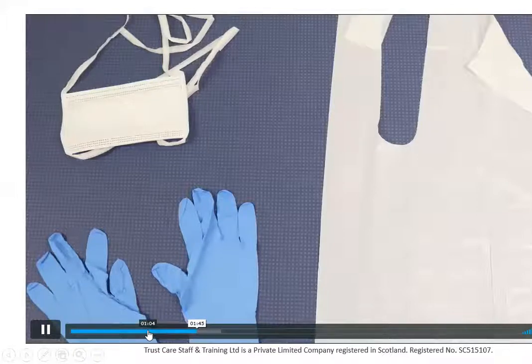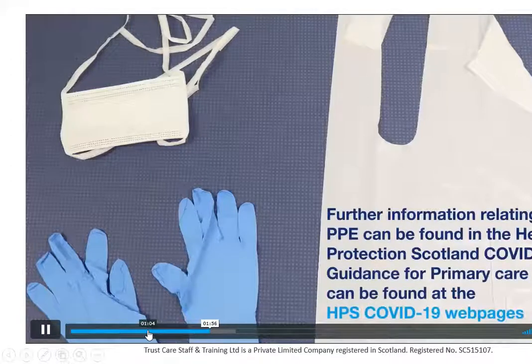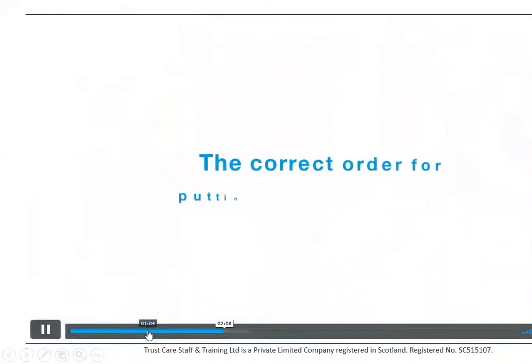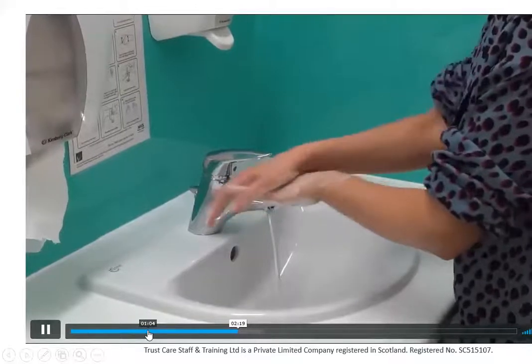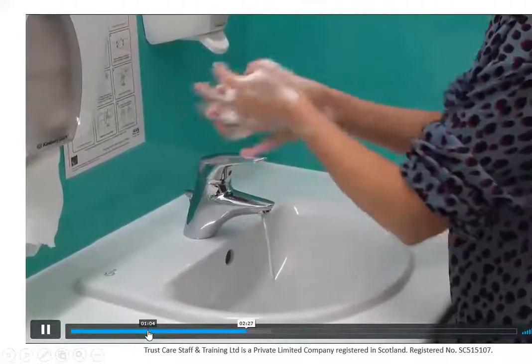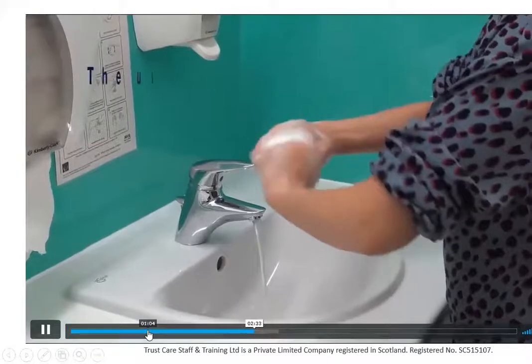It should be well-fitting and fit for use. If you need to wear eye protection, it should be provided by your employer and assessed if you think you're going to get any splashing from body fluids. You wash your hands in advance of putting PPE on — thorough hand hygiene for a minimum of 20 seconds using soap and water. You should tie back your hair, remove any jewellery, and if you've got any breaks or cuts in your skin, you should cover those with waterproof dressings.